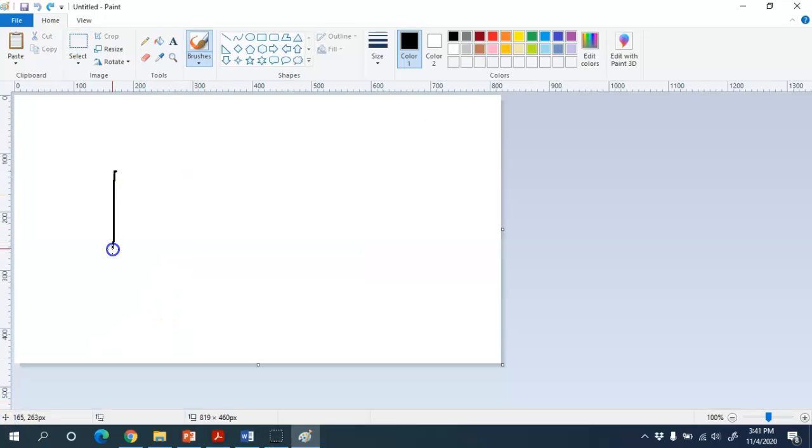First you need to draw a vertical line here. Sorry if it is a bit rough, because I am using a drawing pad, so I am not used to it yet. First you need to draw the unretained species. Then the second one is the propanol, and the third one is the butanol.